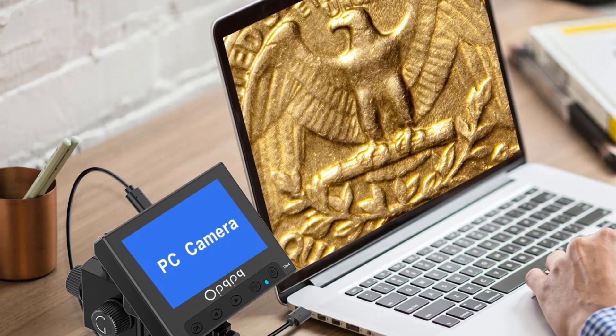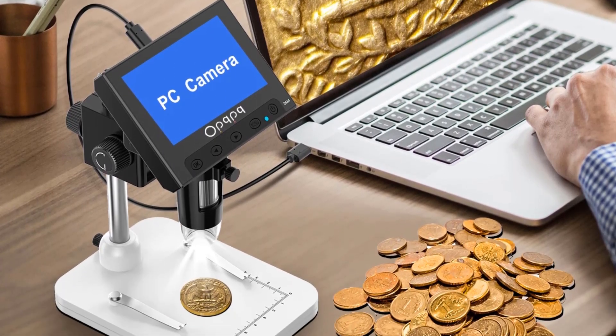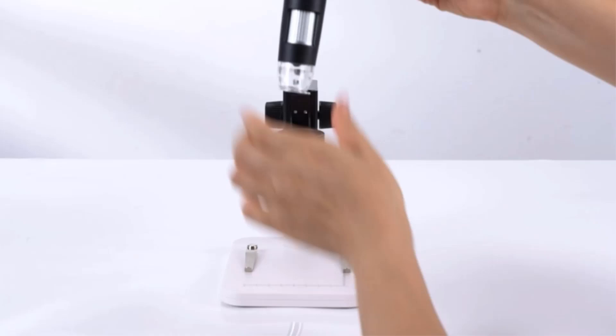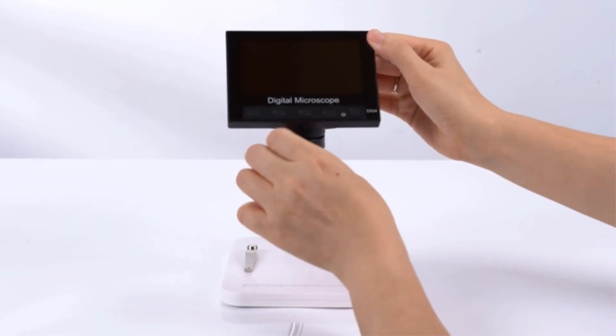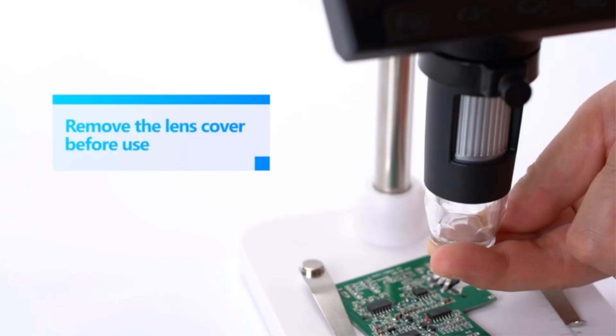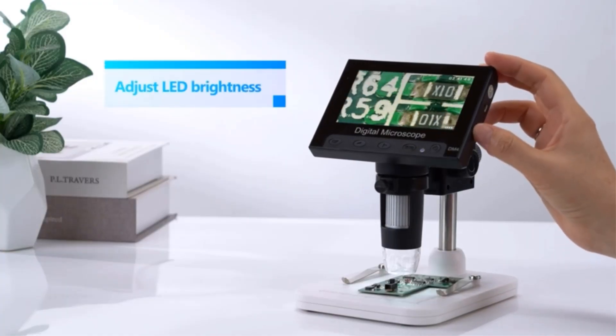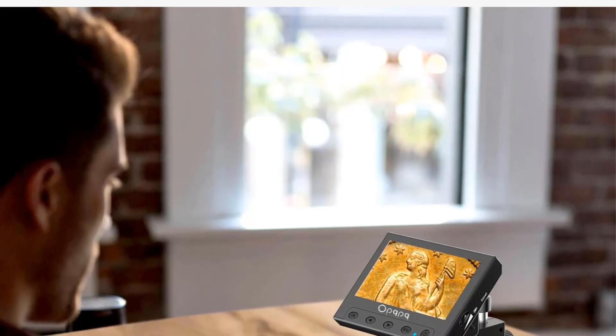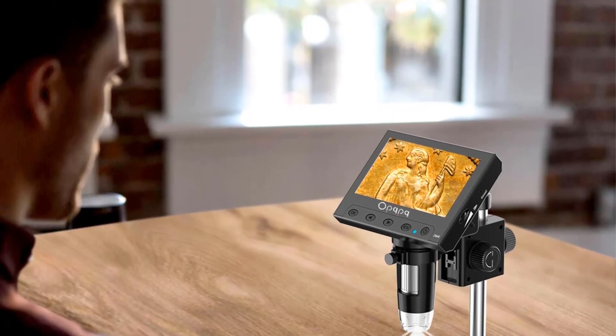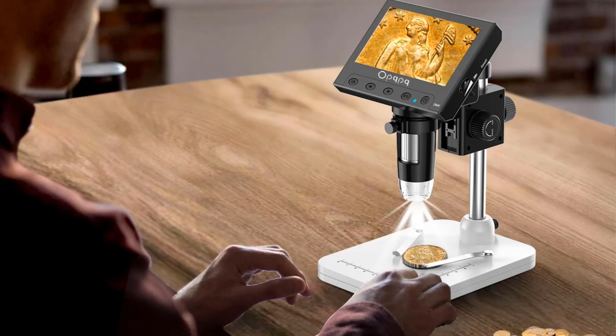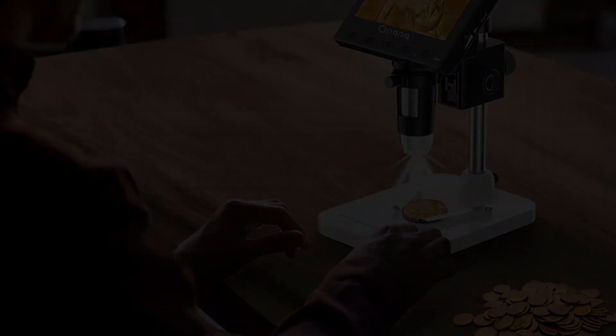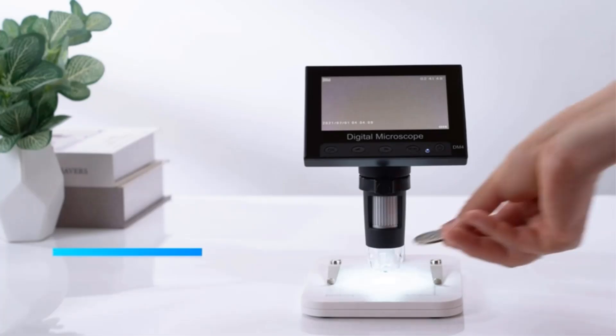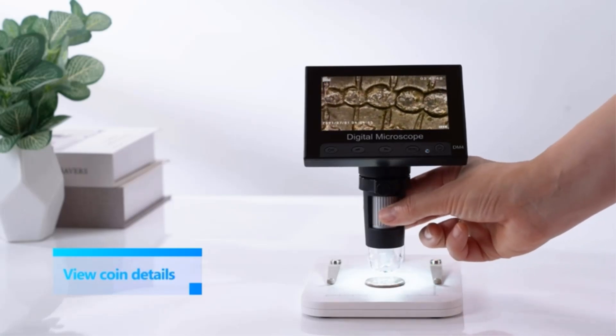The device offers automatic white balance and exposure, ensuring clear images with a maximum photo resolution of 3MP and a video resolution of 720p. The microscope is equipped with a manual focus adjustment, supports microSD cards up to 32GB, and connects to computers through a micro-USB interface. It is built to operate under a wide range of temperatures, has a compact design, and supports multiple languages, making it user-friendly and versatile for detailed inspections and research. The package includes the microscope, data cable, multifunctional support, and a user manual, all encapsulated in a sleek black design measuring 16x12x6.5 cm.